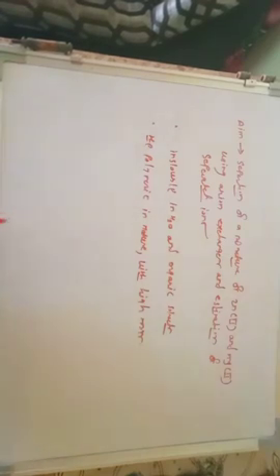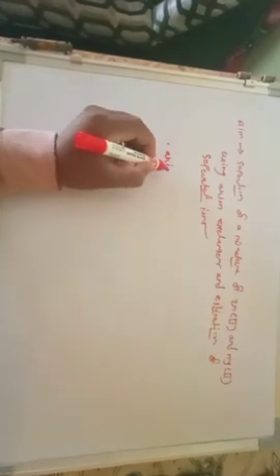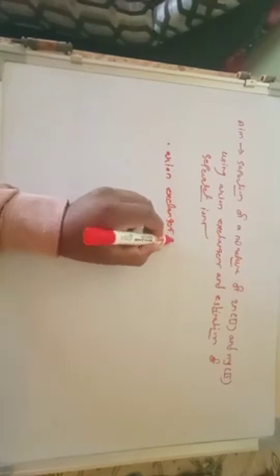So we can write here, for the separation you have to use anion exchanger resin for the separation of zinc(II) and magnesium(II).